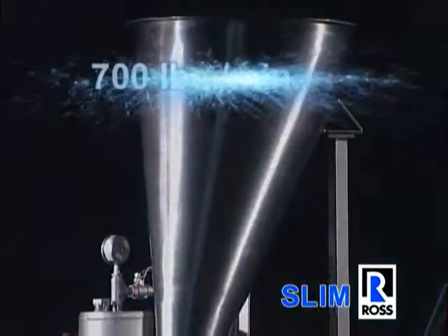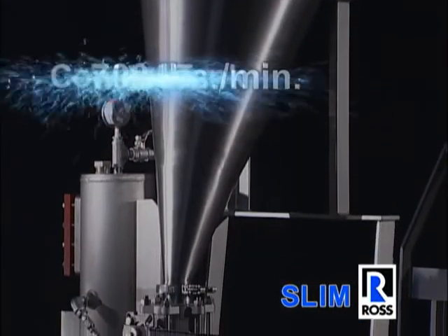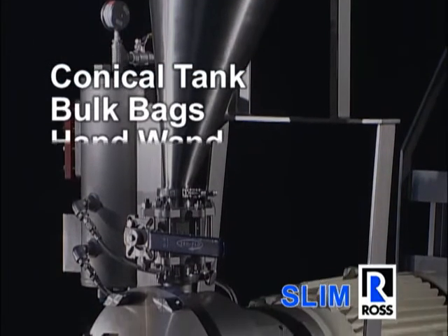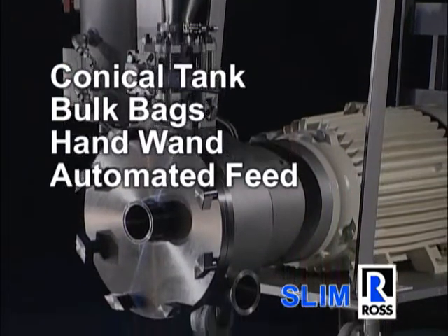The Inline Slim System can induct powders at rates up to 700 pounds per minute. A conical supply tank, bulk bags, a hand wand, or automated feed systems can be used to supply powders to the system.